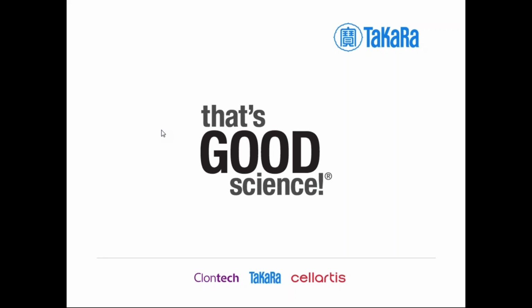I recently saw a paper in which the authors delivered recombinant Cas9 to plant protoplasts, I think from Arabidopsis and rice. We have not validated our recombinant Cas9 for this purpose, but I saw this publication, so I think technically electroporation, or they used, I think, PEG transfection of recombinant protein can be possible. And our in vitro screening and also the downstream mutation detection, genotype confirmation and indel identification kits are also suitable for plants or fungi because they contain the polymerase, and you can also do direct PCR on such samples.